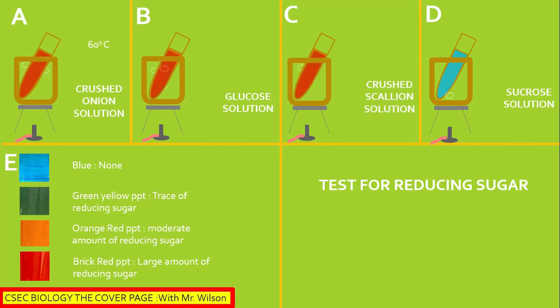A brick red precipitate suggests that there is a large amount of reducing sugar. The precipitate is formed as the Benedict's solution reacts with the contents of the tube to form a solid product we call a precipitate. The Benedict's solution is blue because of the copper ions present. For the sucrose solution, it has not changed — it maintained the color of the Benedict's solution.